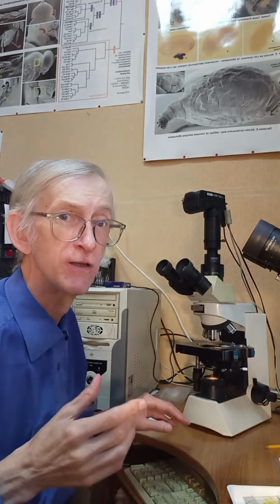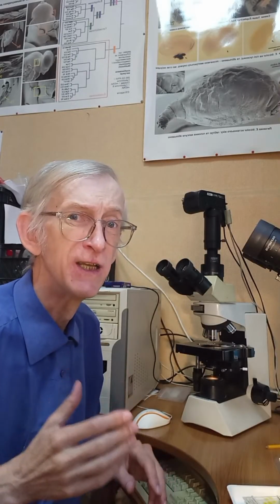And I need to take a lot of photos because I need to investigate about 30 specimens of different species for correct identification, because of variety. Sometimes you need to take a sample of 50 specimens. Maybe one or two can belong to another species, surprisingly. That's not a good idea.